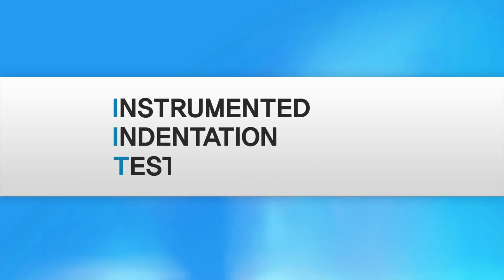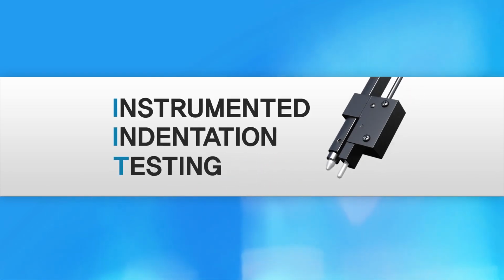With this video demonstration, we would like to give you a brief introduction about IIT and basic principles of equipment setup and operation by showing you some video clips.